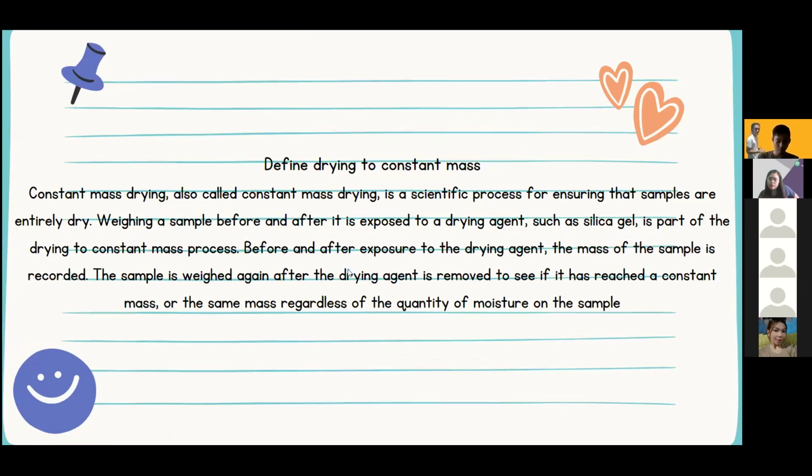So in line with the previous explanation for defining drying to constant mass, heating the crucible, we all know, is a preparation before the filtration process. Then there might be some leftover inside the crucible after we filter it, and that might affect its weight, like moisture, which was mentioned also, and therefore we need to heat our crucible again.